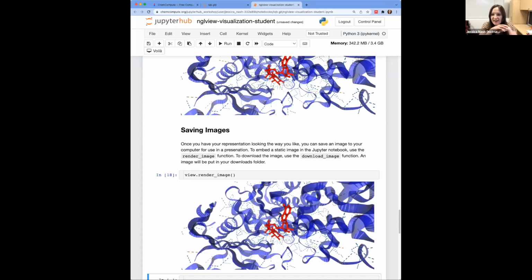We had a question about just seeing contacts between the ligand and the protein. I think that it would be really great if there was a keyword to do that. There doesn't seem to be a built-in keyword for that. You can do it if you do a bit of scripting with the libraries. I spent some time trying to figure it out also, but it's sort of beyond the scope of what we're doing in this workshop. I'll see if I can figure something out and send it out to everyone, or you all can play with it and see. It might require us to use another library, because there are other libraries that we can use NGLView in that might know more information about the ligand and protein that might help us do it.